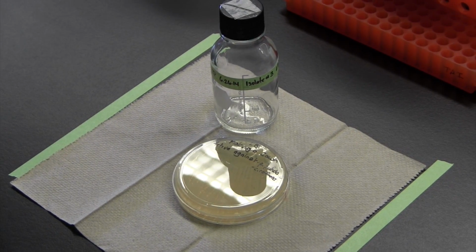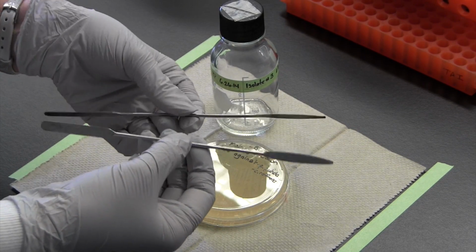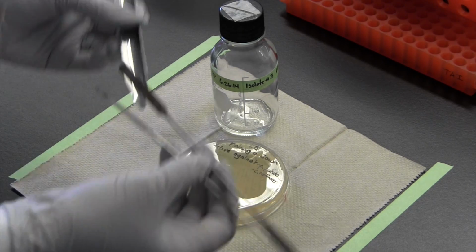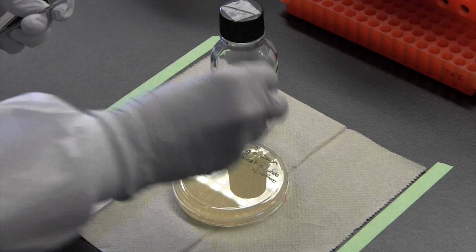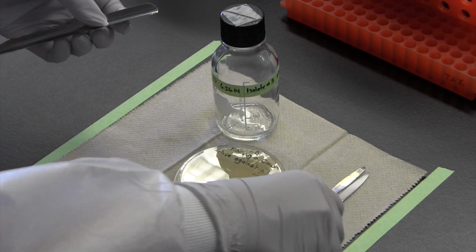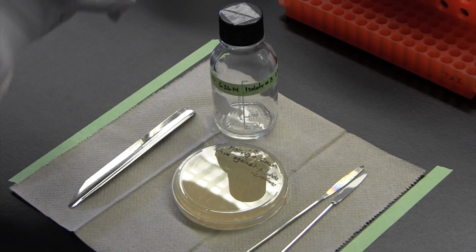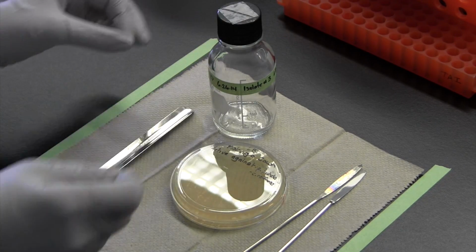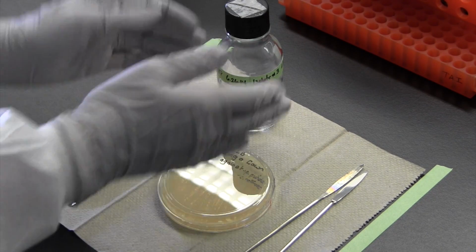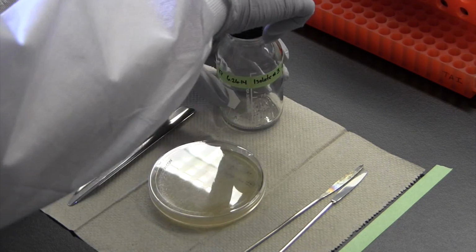Most people use metal spatulas for cutting up the agar in your Petri dish. And it's easier if you have more than one tool. It's tempting for the students to grab pieces perhaps with their hands, but there's lots of different approaches that you can take. We've had a student, we called it the appetizer approach, and she just used a toothpick and poked the pieces of agar and put it in the bottle. But essentially, whatever makes it easiest to make these small pieces of agar and get them into our glass bottle. So I'm going to go ahead and demo this now.